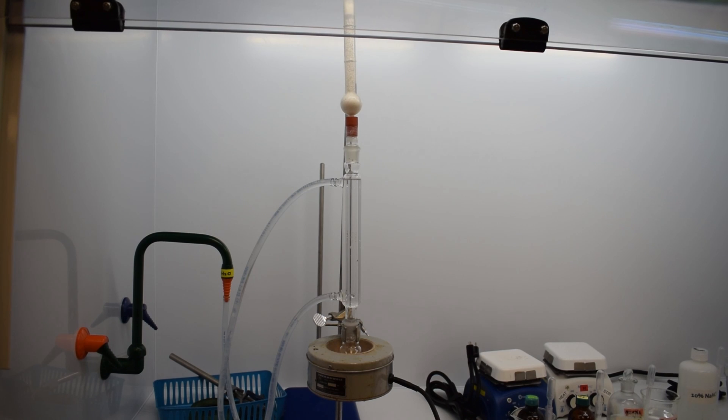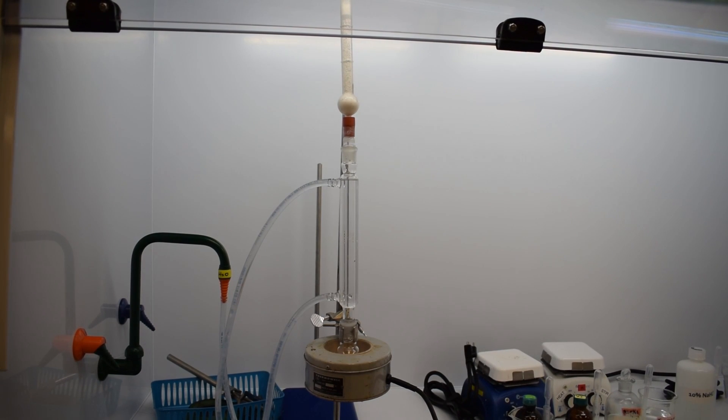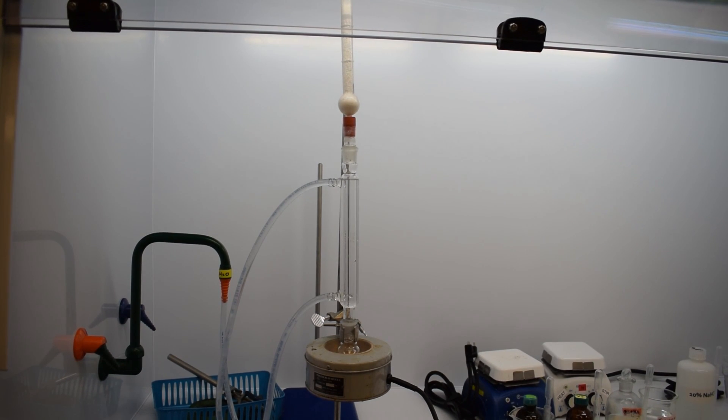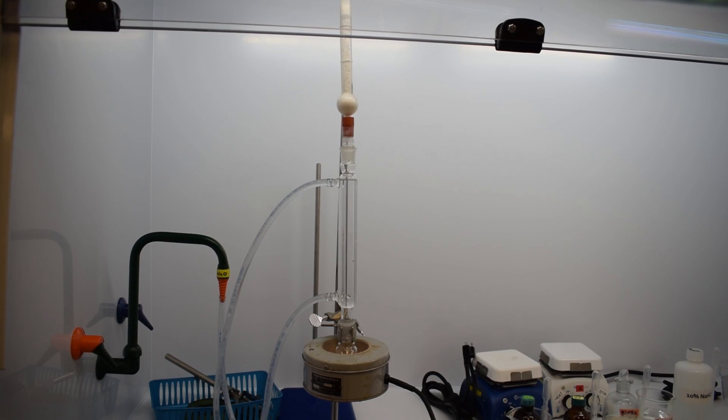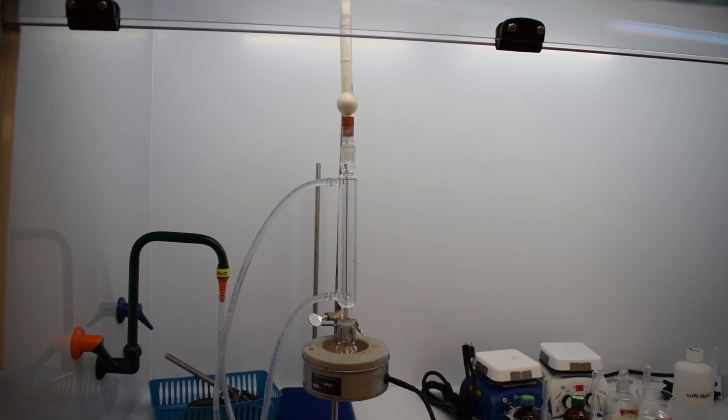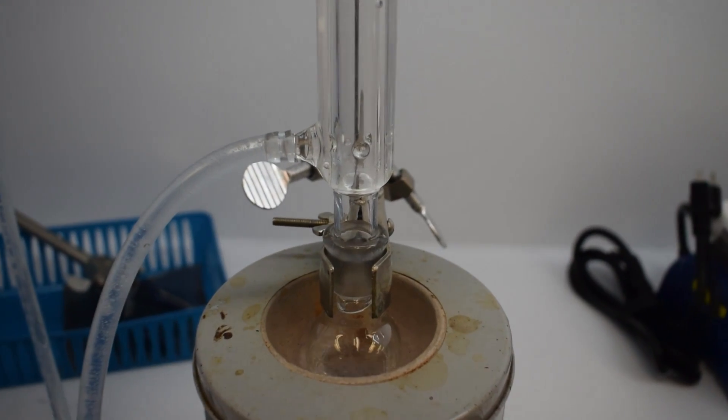The purpose of this apparatus is that it will heat the reaction to boiling. When it boils, it will vaporize and those vapors will rise up and reach the condenser where they will condense and turn back into a liquid to rejoin the reaction mixture.